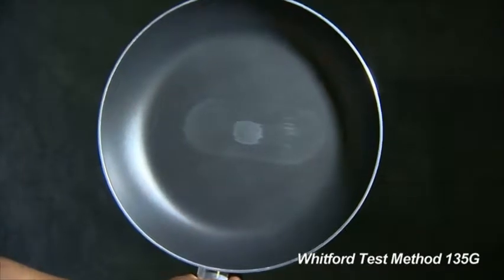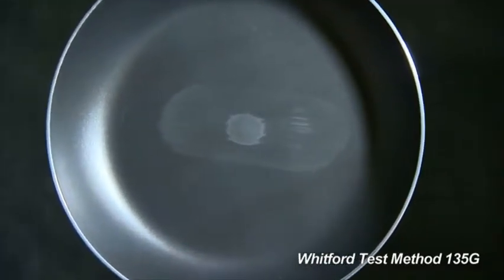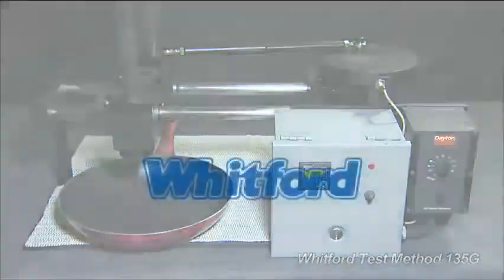We can compare the coating's performance against other coatings tested. The Reciprocating Abrasion Test, from Whitford, where good ideas come to the surface.